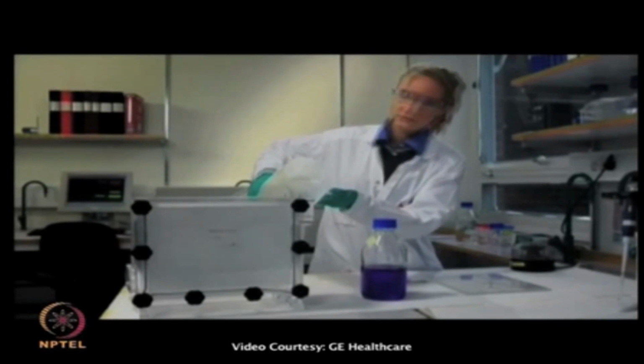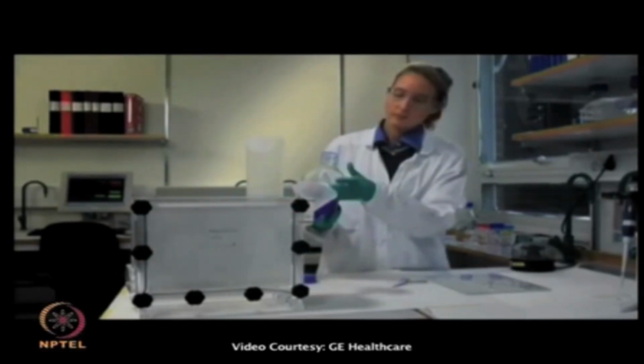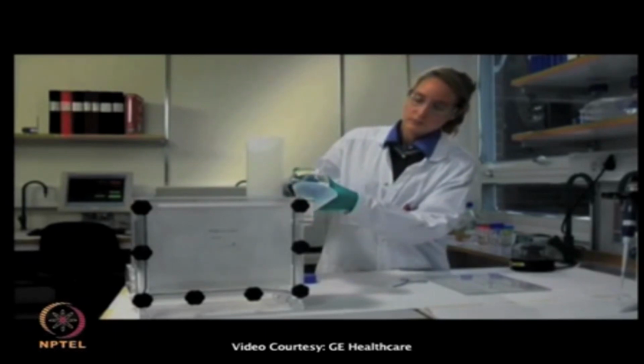Large 12% Laemmli gels were cast using an Ettan DALT 12 gel caster. Displacing solution was added to avoid polymerized acrylamide gels in the tubings. The gels were allowed to polymerize overnight at room temperature prior to use.